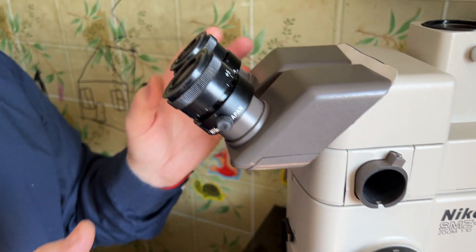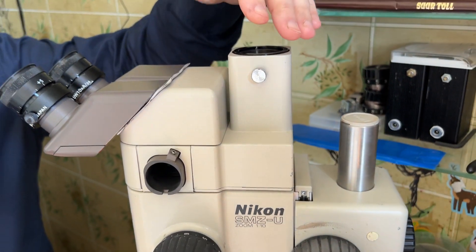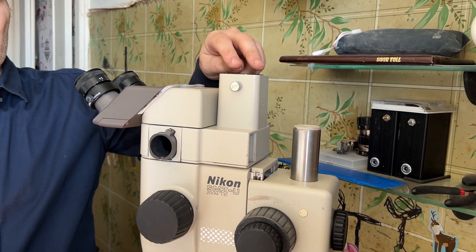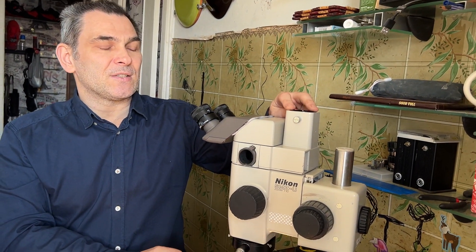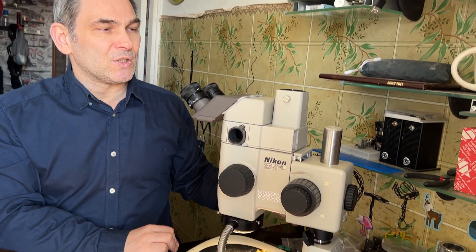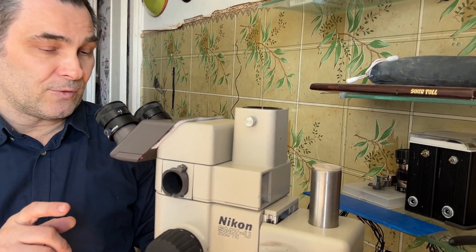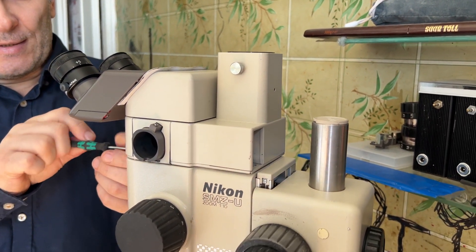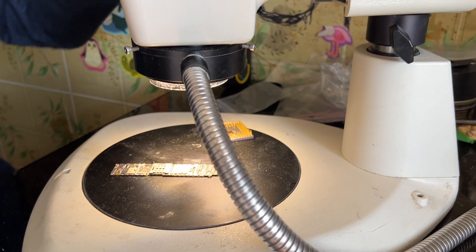When we turn the photo splitter to photo mode, we still have a stereo picture on both eyepieces and one port is getting the picture for the camera. For this exact configuration we will use a camera with a projecting eyepiece, but most of my customers get an eyepiece here for attaching a mobile phone.